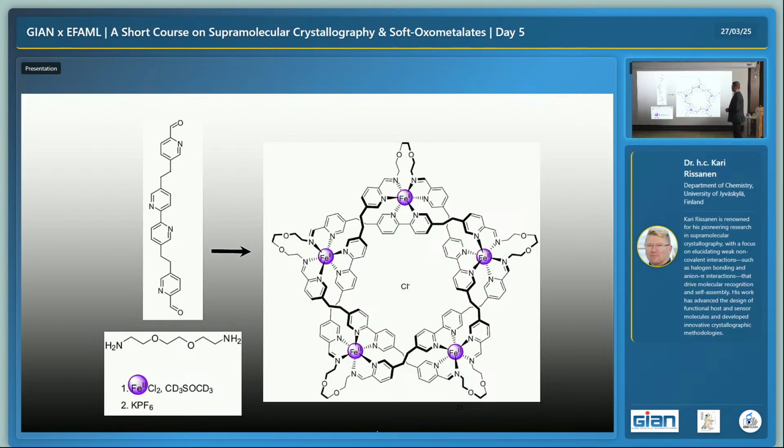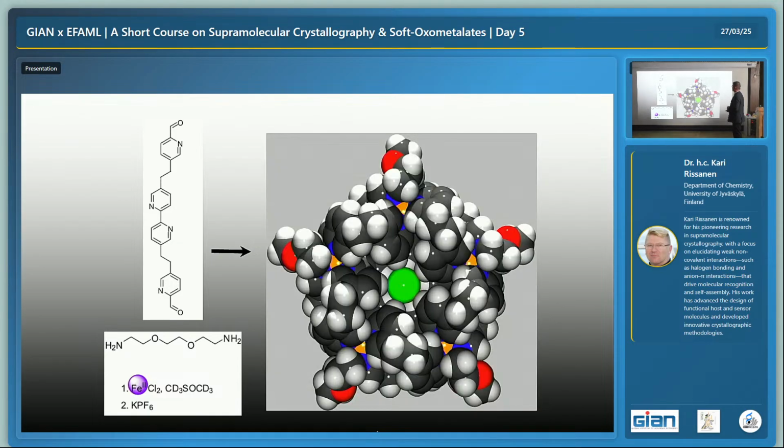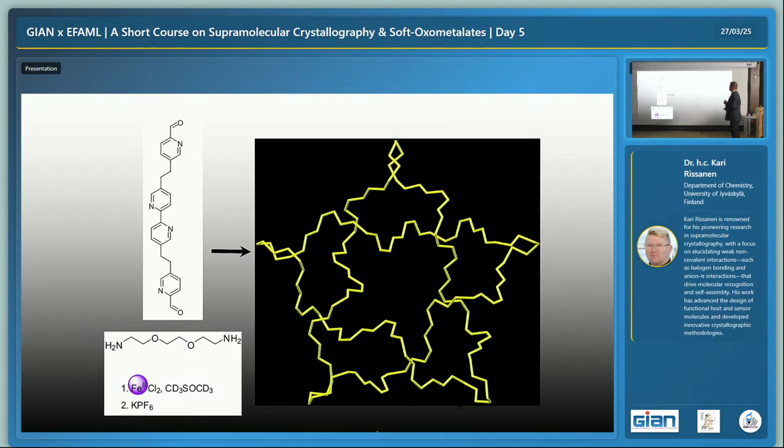The idea is that the molecule goes like that. So that's how the X-ray structure looks. You can see there is no empty space, so it's really a tight knot. And in here, these are the same connections, but I deleted all the atoms which are not part of the chain. So let's start from here. We are on the top, go here in the loop, and then here it goes down. Then in here we go up, loop, down, up, loop, down, up, loop, down, up, loop, down, and again.